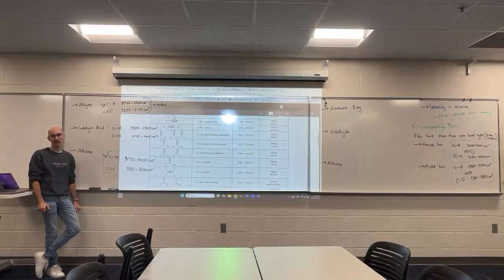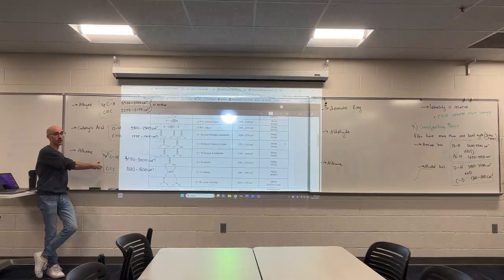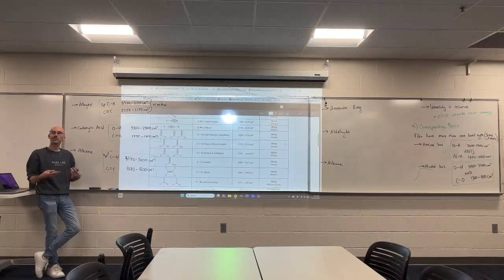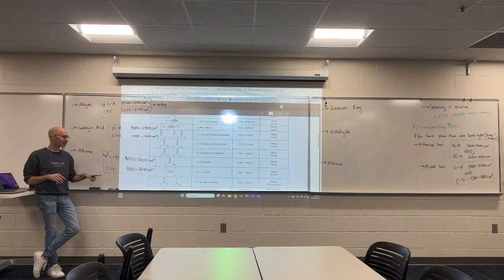And so there is experimental data that I get from students, and they say, I'm looking for the corresponding peak, I'm looking for the CC double bond, and I don't see it. Okay, that's okay. That gives you a good write-up if you're in a lab setting to say, I'd expect to see a signal in this region corresponding to the alkene, but I don't see it. Question mark, interesting, move on. It shows that you understand how to interpret it.